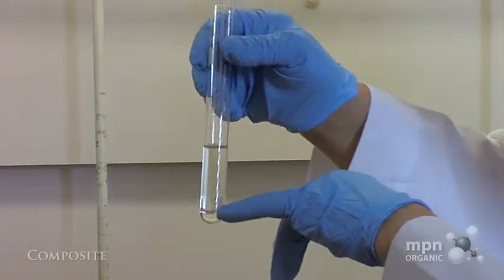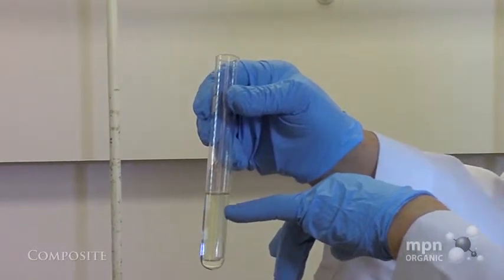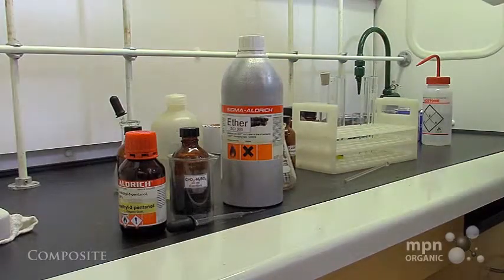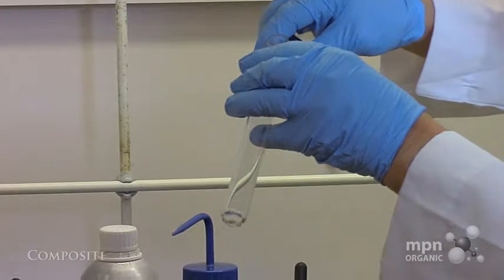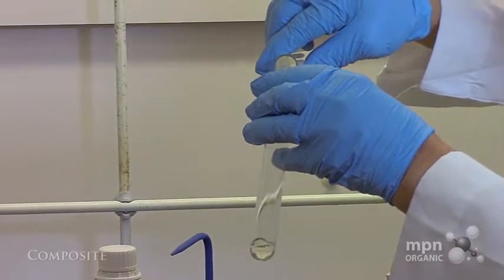You can see now we still have our 2 layers. The water's on the bottom. The ether is on the top. All right, let's decant this into another test tube. And now I'm going to dry it. I want to get that water out of there because I want to evaporate off the diethyl ether.